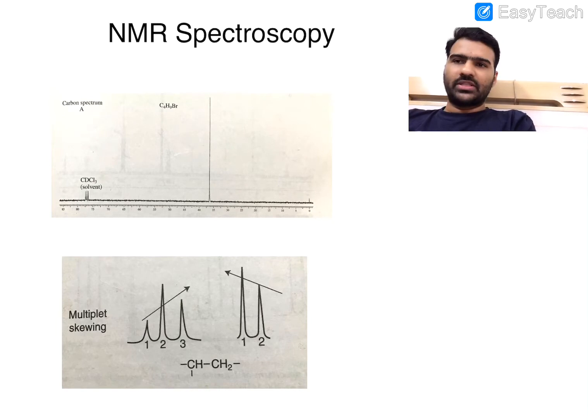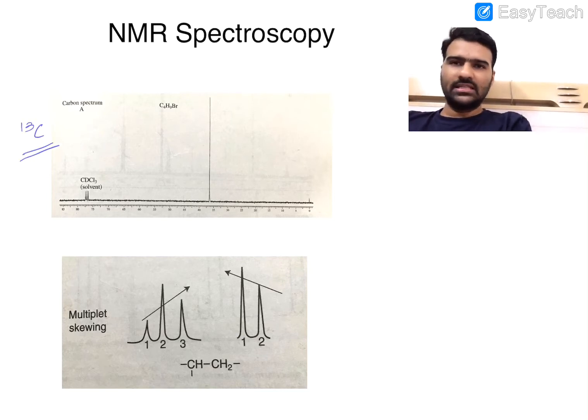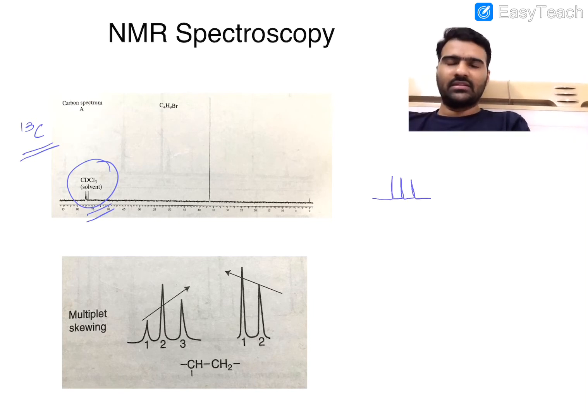Alright, let me close this video with two interesting trivia that you may have observed in a C13 spectrum. Now I'm getting a little ahead of myself, but I'm sure that all of you have seen C13 spectra. And if you've noticed, wherever you see a solvent peak, typically where the solvent happens to be CDCl3, you'll always see a triplet with equal intensities there.